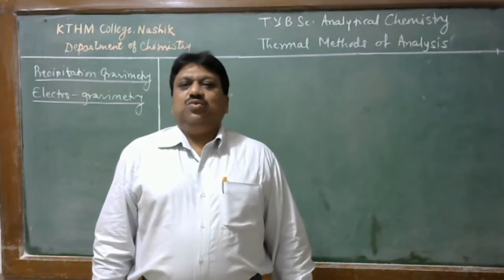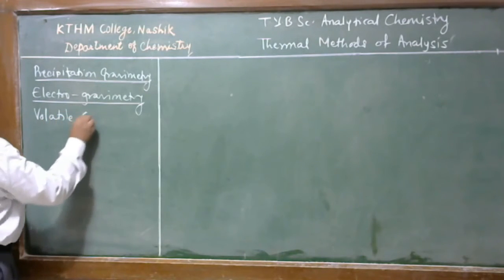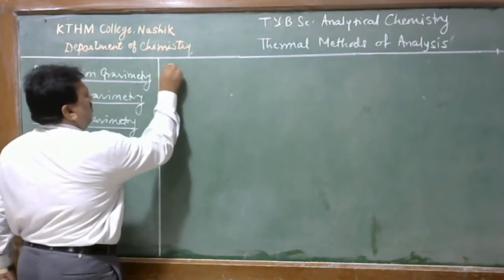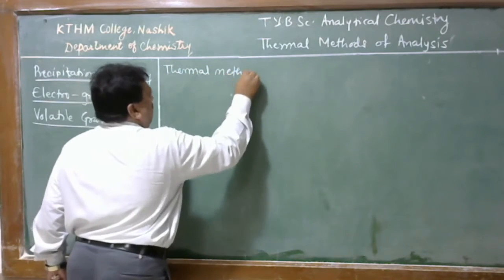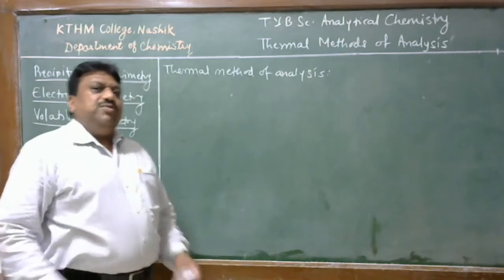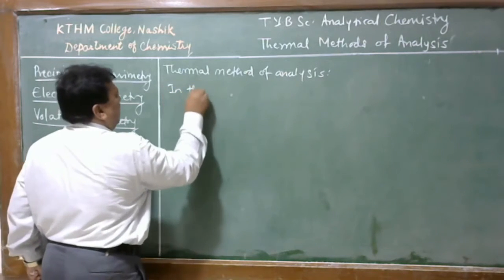Students, in today's lecture we discuss volatile gravimetry. Volatile gravimetry is the name given to the thermal methods of analysis. Thermal methods of analysis.